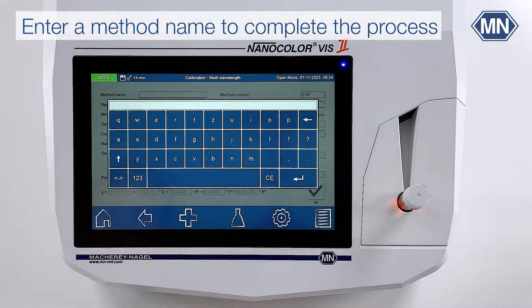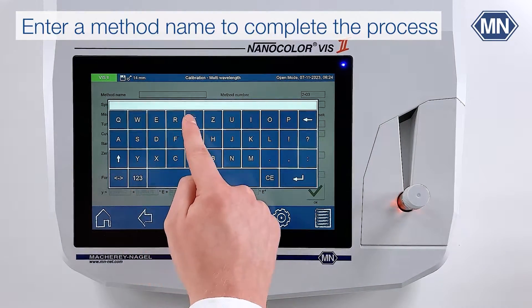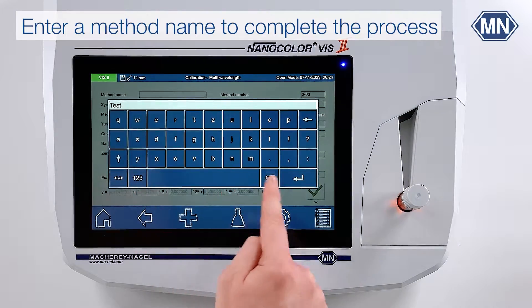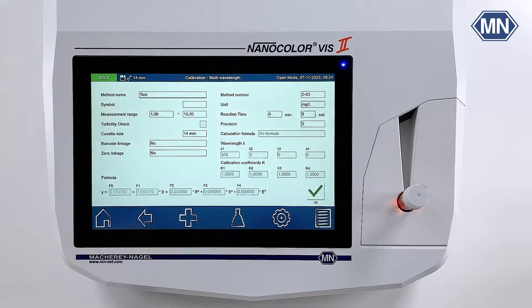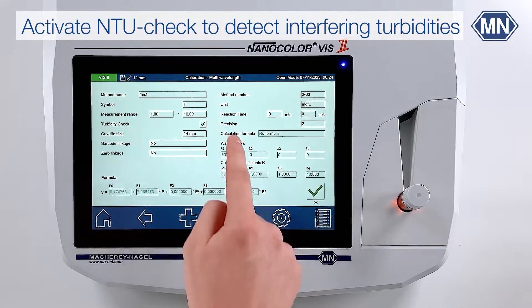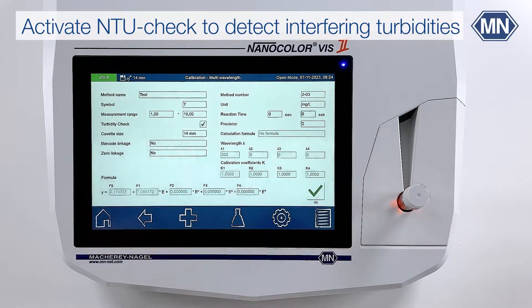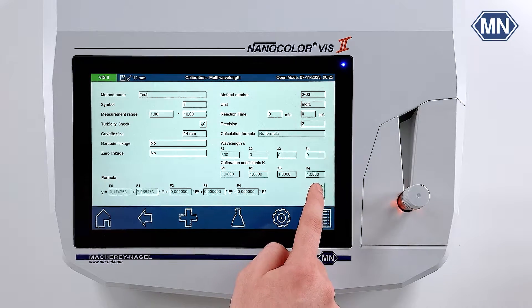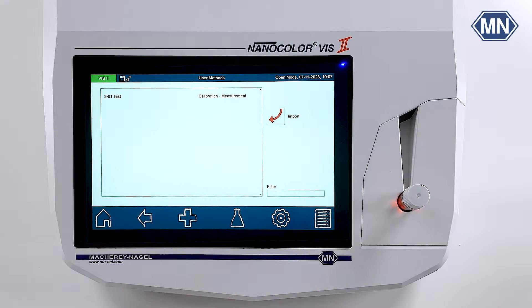The last step is to enter a name for the method and the symbol to be displayed by the photometer. We always recommend enabling the unique NTU check to automatically detect interfering turbidity in your samples. When you confirm the creation of the method, it will be saved in the list of user methods in the special method menu.